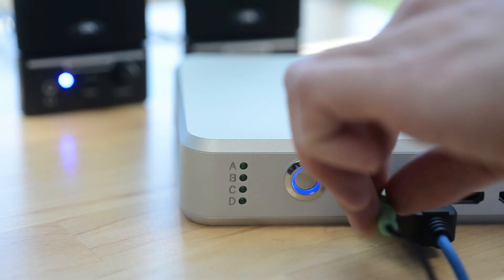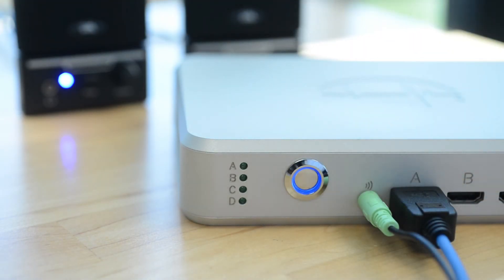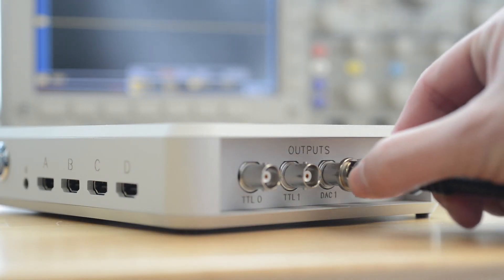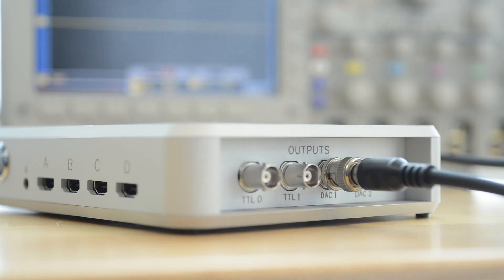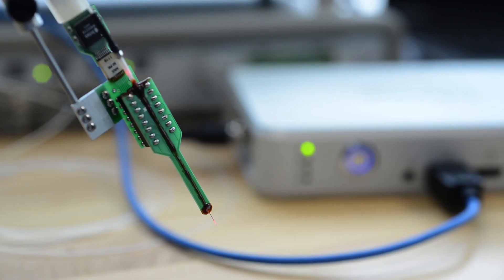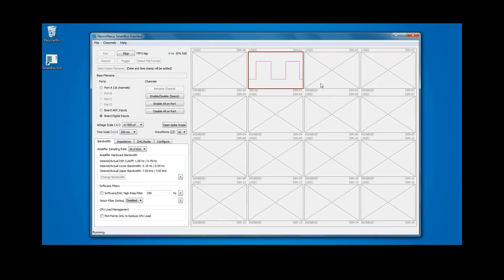For auditory monitoring, connect speakers to the smart box. Alternatively, if you are using an oscilloscope to monitor signals, connect it to the DAC-OUT connector on the smart box. Other accessories, such as lasers or signal generators, can be connected to the smart box. Input from signal generators can be configured to leave a timestamp on recordings.